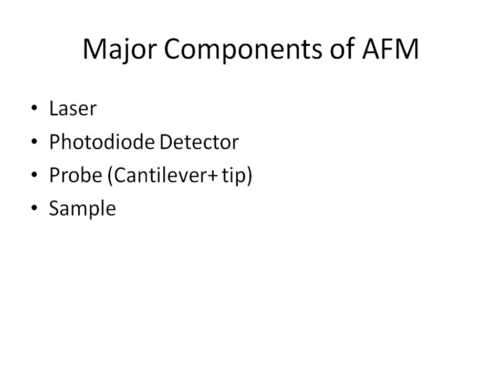The probe consists of the cantilever, and the cantilever holds the tip, and the laser reflects off the cantilever. The tip feels the surface of the sample and moves horizontally and vertically to analyze the topography of the sample surface as it moves across in that raster pattern that we talked about. And then, of course, you have your sample, which is the analyte that's being analyzed or determined.